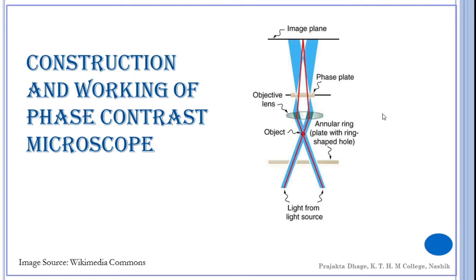The phase contrast microscope also alters the phase and usually the amplitude of one wave in relation to the other. This is achieved by inserting an annular phase plate at the rear focal plane, in an annular groove. The working of a phase contrast microscope requires no special skills or accessories. The image formed is due to the amplification of minor phase changes and their conversion into changes of amplitude.